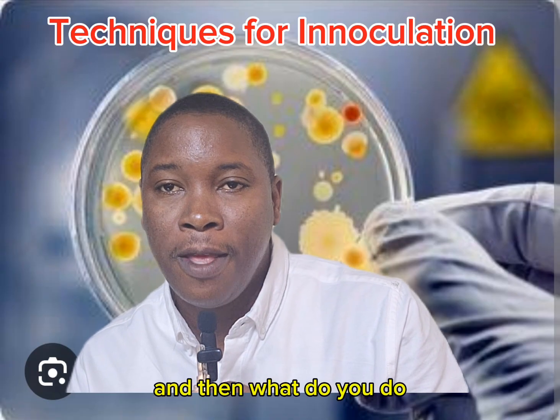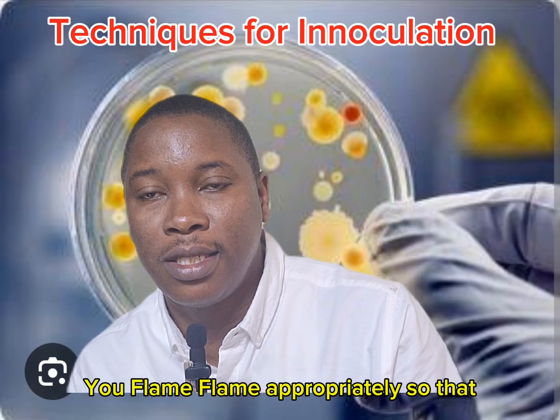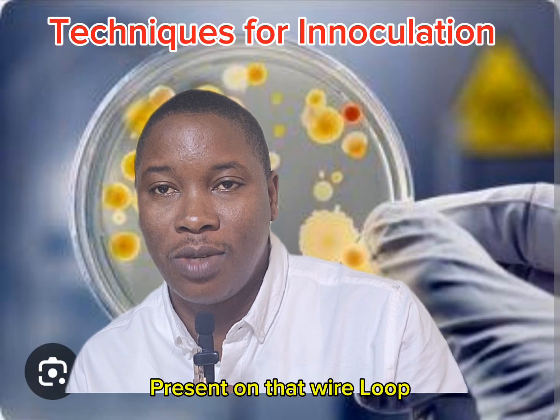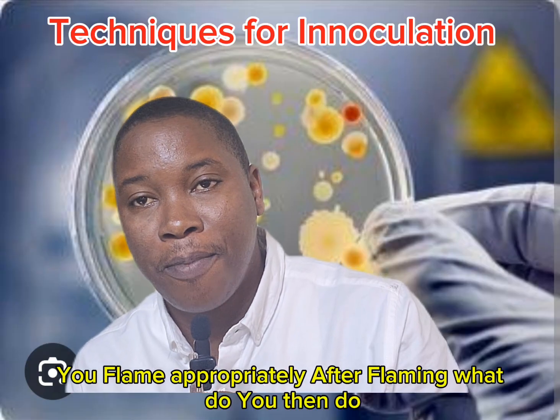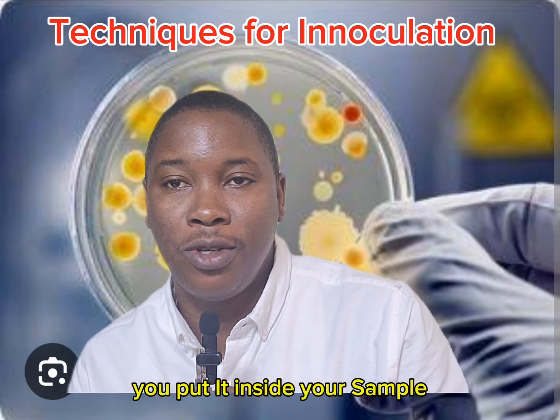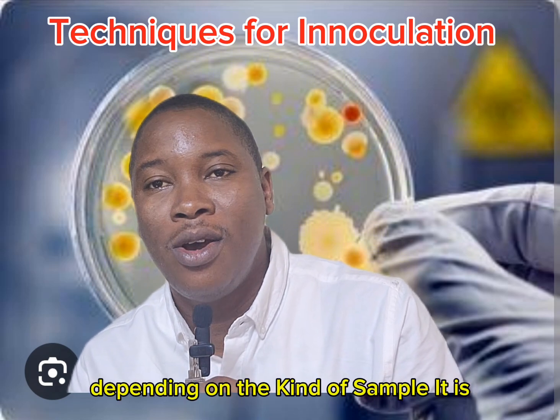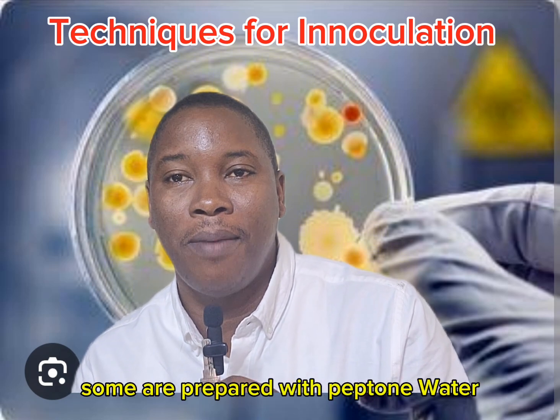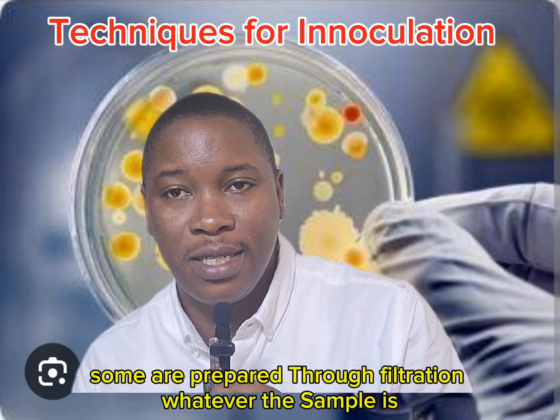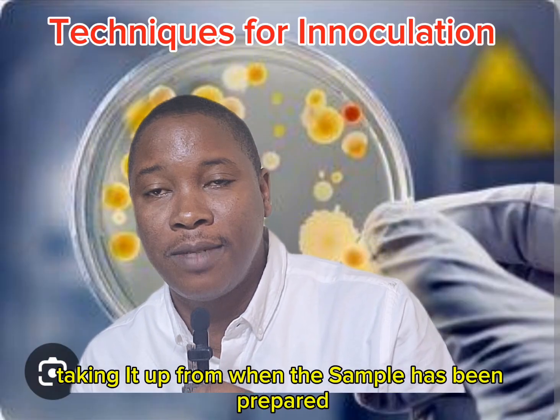You take your inoculating wire loop, and you flame appropriately, so that you kill any microorganisms that may be present on that wire loop. After flaming, you put it inside your sample. Your sample will have been prepared. There are processes for preparing the sample depending on the kind of sample it is. Some are prepared with peptone water, some are prepared through filtration. But we are just taking it up from when the sample has been prepared.